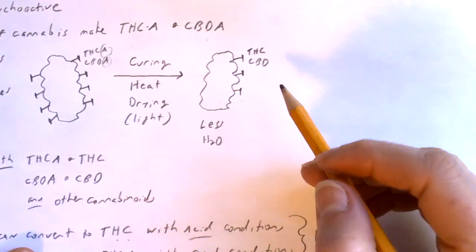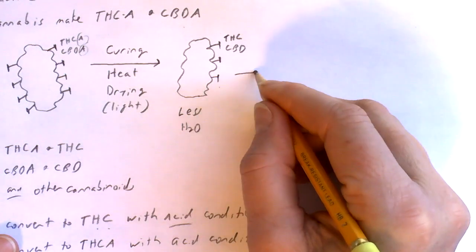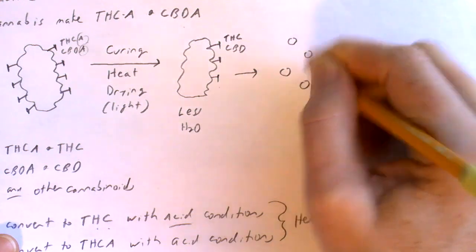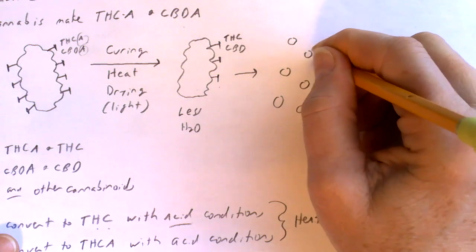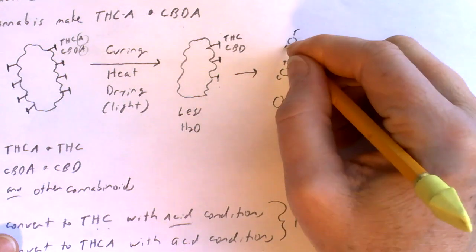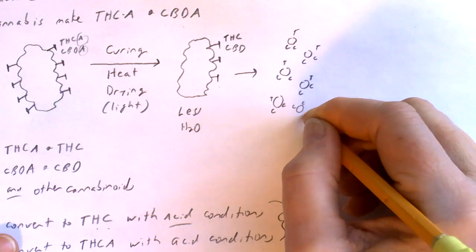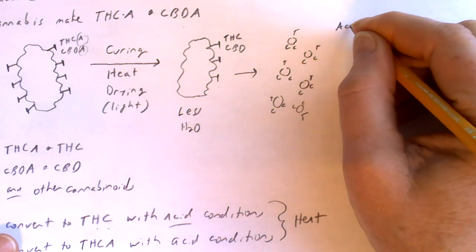Or else, think about it. So if you took this and homogenized it and you had all your little pieces, remember, and it's got our THC and it's got our CBD, and maybe we've got twice as much CBDs as THCs in every piece because it was a low THC relative to CBD piece of plant, right? What if our solvent had some acid?